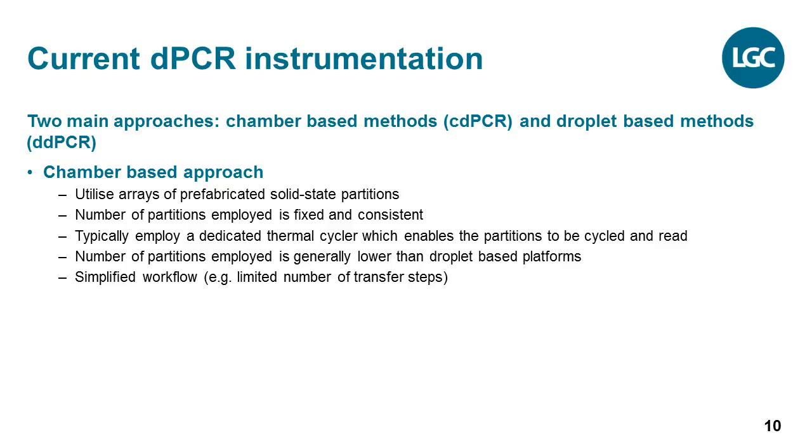Chamber-based approaches utilize arrays of prefabricated solid-state partitions, where the number of partitions employed is both fixed and consistent between experiments. The approach typically employs dedicated thermal cyclers which enable partitions to be cycled and read. Although the number of partitions is generally lower than for droplet-based platforms, the approach is associated with simplified workflows.